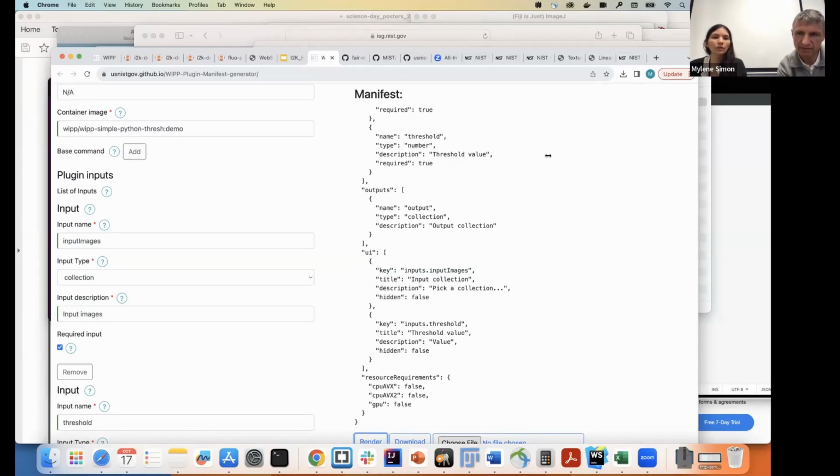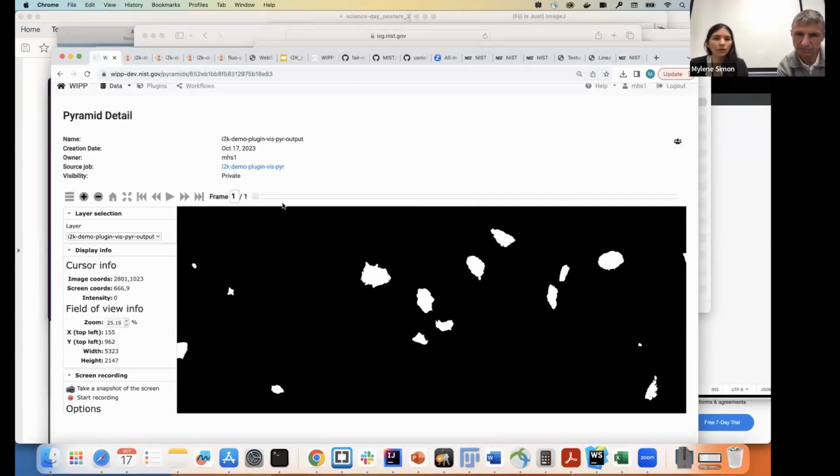And we have also explored, from this view, having two sliders. This one can handle a temporal sequence, so you can have multiple frames and go through all of the frames. What we have explored is also adding a second slider to go through the Z slices. So it's two things that we are currently exploring.